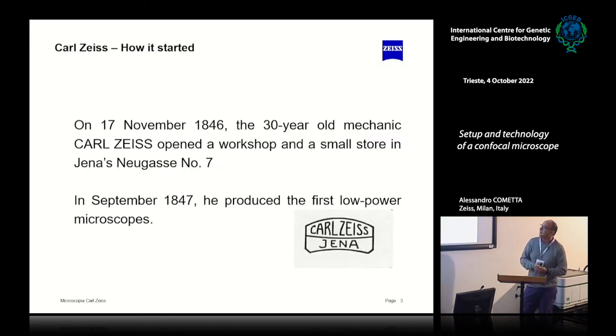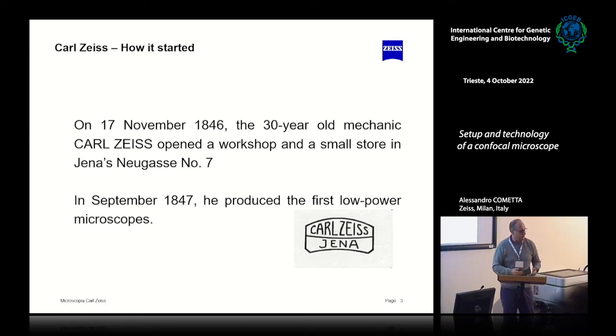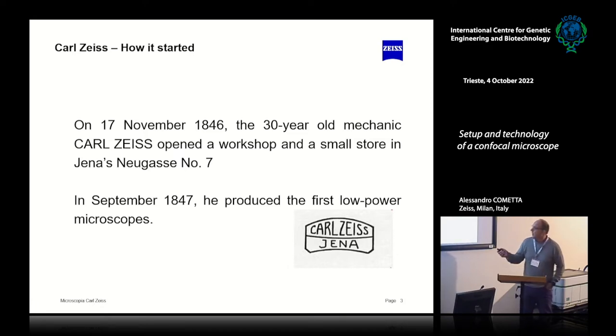So he decided to investigate a little bit, and he hired an employee, a young researcher at the university, a young physicist, now Professor Abbe, with a difficult task, because he had to investigate the laws of optics. He discovered laws that we are still using today. The brand of the company is a doublet achromatic, so two lenses able to correct for the distortion of the lens itself. And with this kind of improvement, he was able to produce even better microscopes year by year.